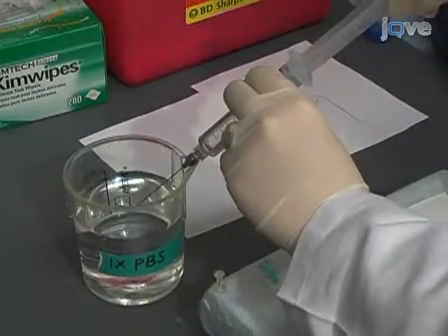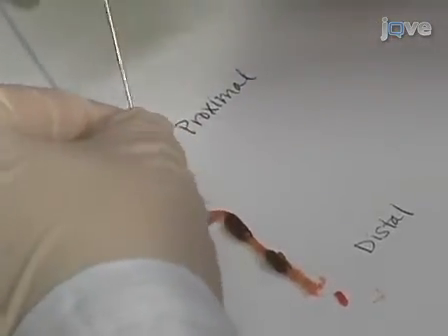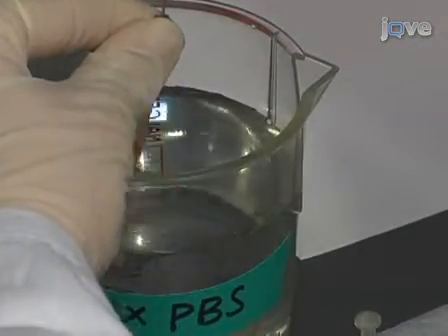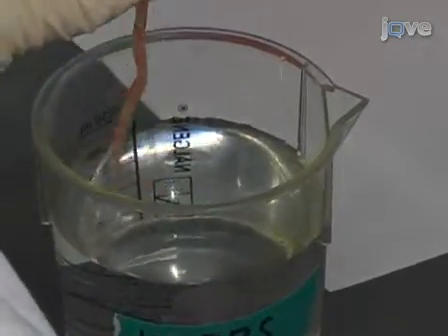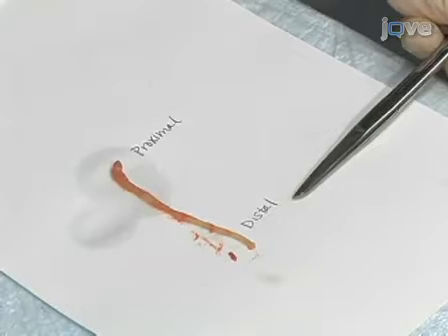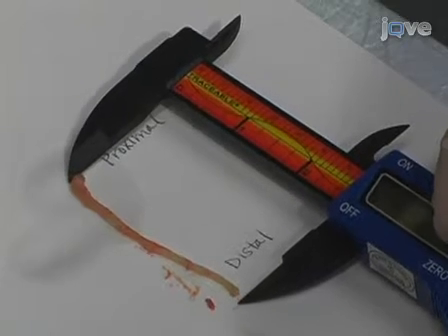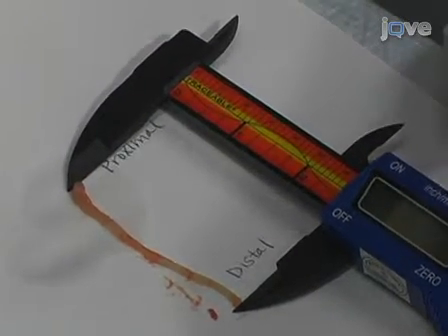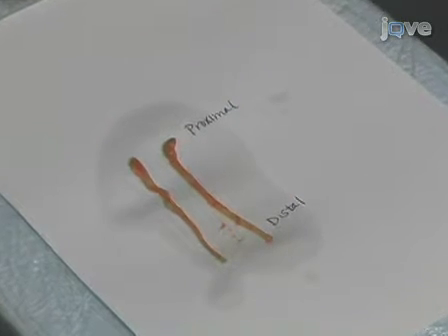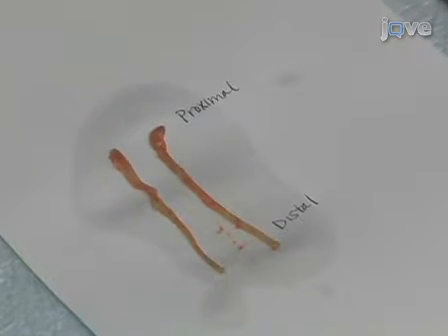Using a 20 gauge feeding needle and 10 milliliter syringe, intubate and flush the colon with ice-cold PBS until the effluent is completely clear of stool. It is important to maintain the correct orientation of the colon by keeping the distal end closest to you. Start by measuring the colon length using a digital caliper. Colon length is another indicator of the severity of injury. Colitis increases edema and shortens the overall colon length.